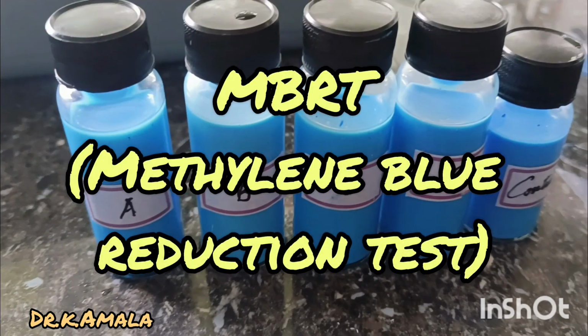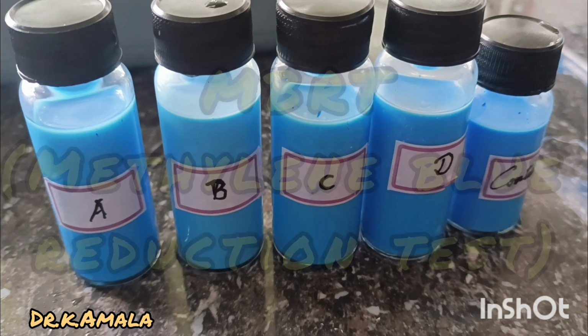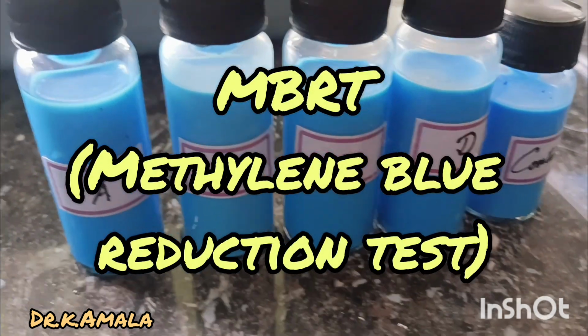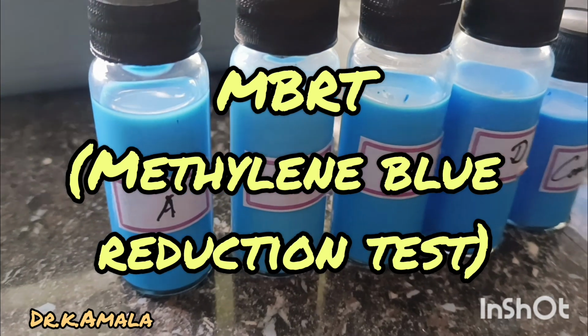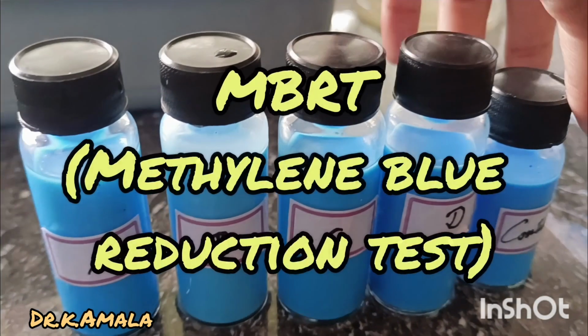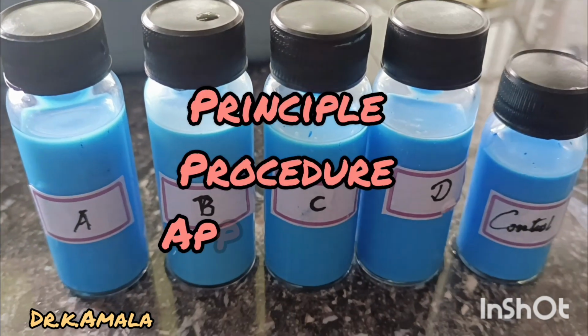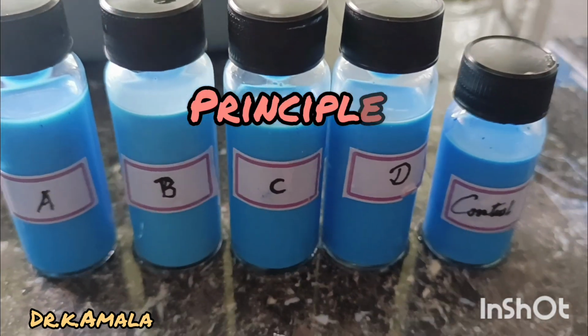Today we are going to explore the MBRT, methylene blue reduction test, an important tool for milk quality checking. If you are interested in MBRT, you are in the right place. In this video, we will be discussing the MBRT method and its principle, procedure and applications. Let's get started.